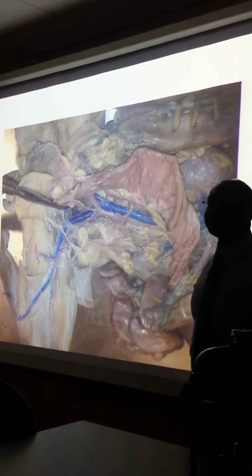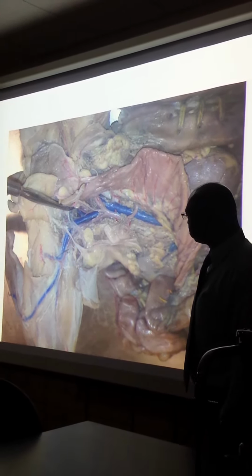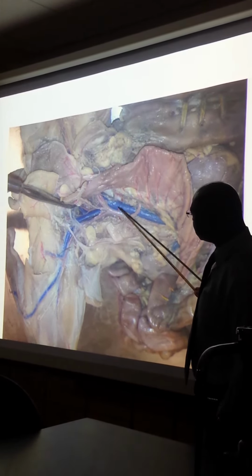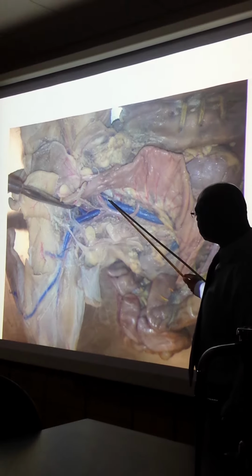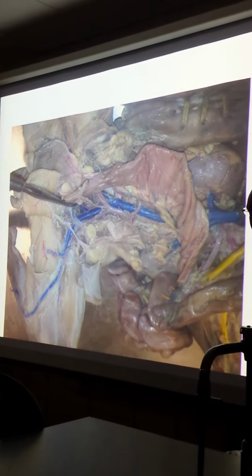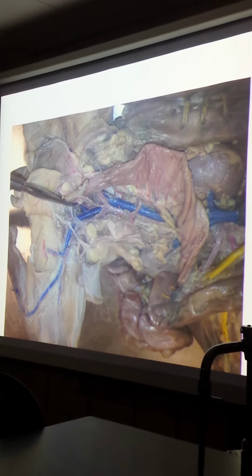Mesenteric artery. Yes. Do you see that? And this is the stump of the iliolumbar. You see this artery, and then the iliolumbar vein is kind of here. But that one is not perfused, so that's why it didn't come out nicely. Okay, and then the renal over here. So we're going towards the head over here.